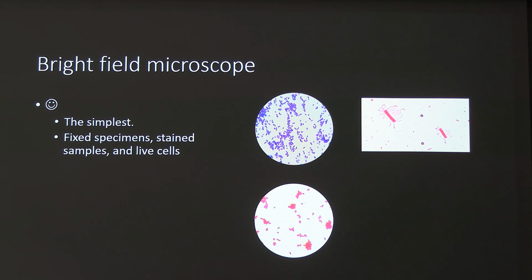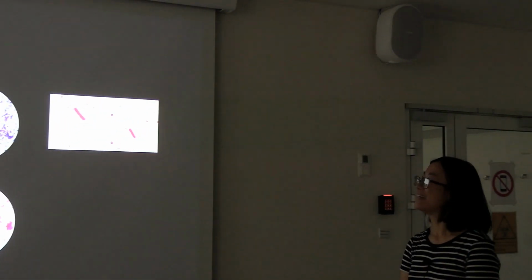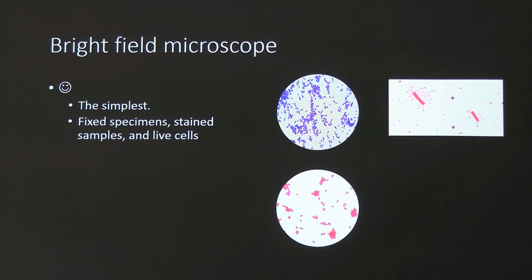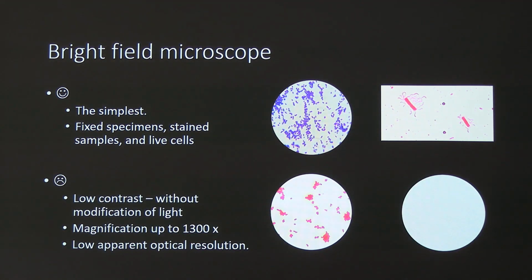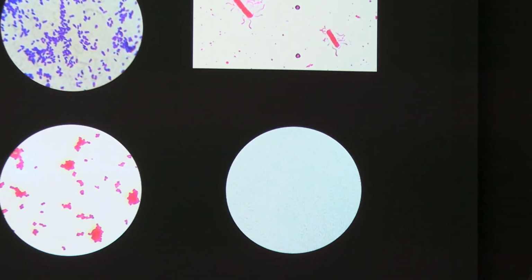Okay, just before we enter the phase contrast microscope, there's a problem with the microphone. So I would like to introduce again the slides and show you why we need a phase contrast microscope. Here shows you a photo of E. coli, the same bacteria as in the other 2 slides, but without staining.